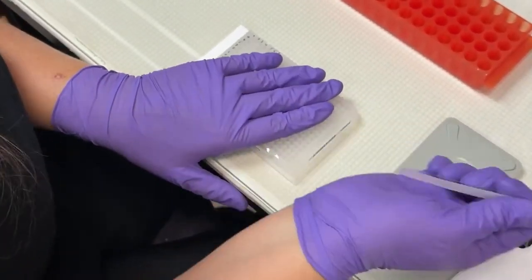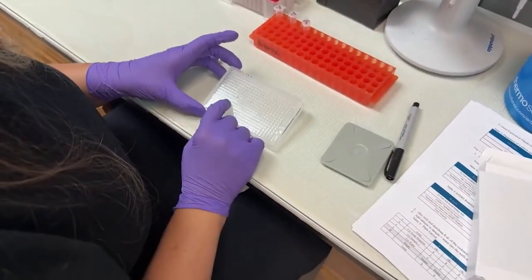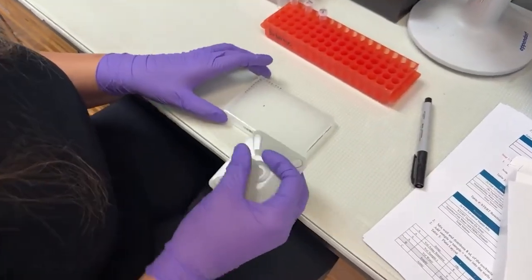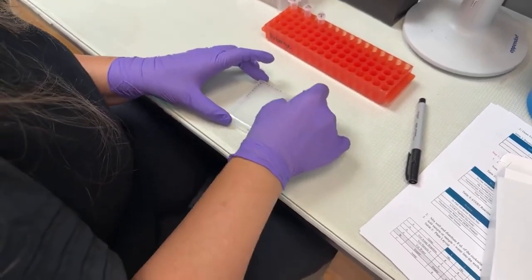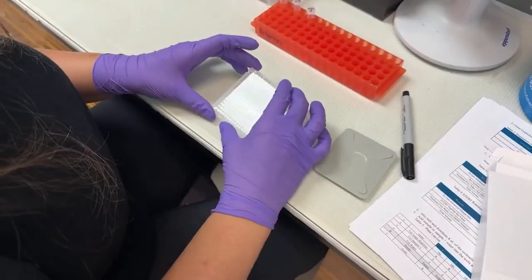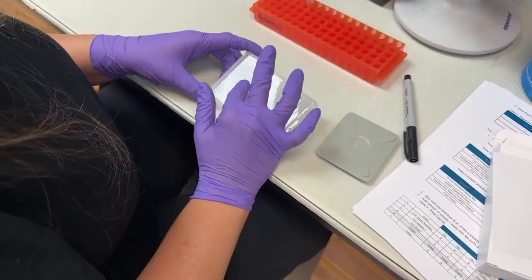I'm going to take the fins off. It's perforated, so just snap those off. Okay. Now what I want to do is double check that I actually have a good seal. So I'm just going to go back over the locations that have samples in them. Give them a good press. And sometimes I'll even take a gloved hand and run my finger over those just to double check that the seal's completed.